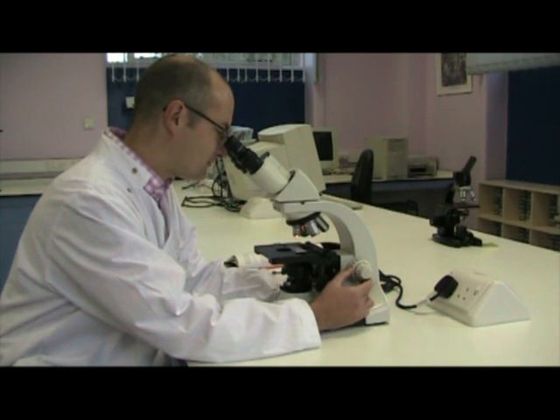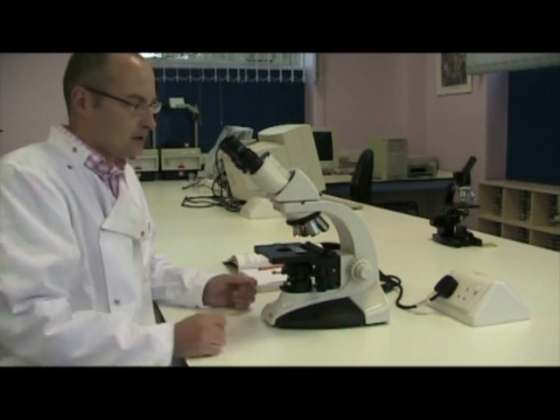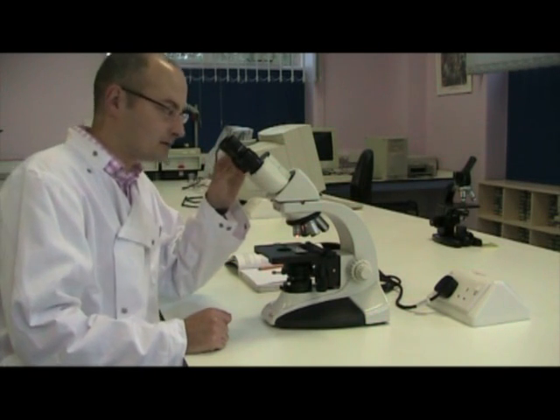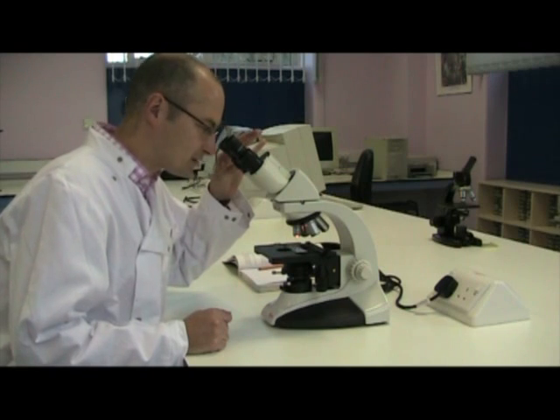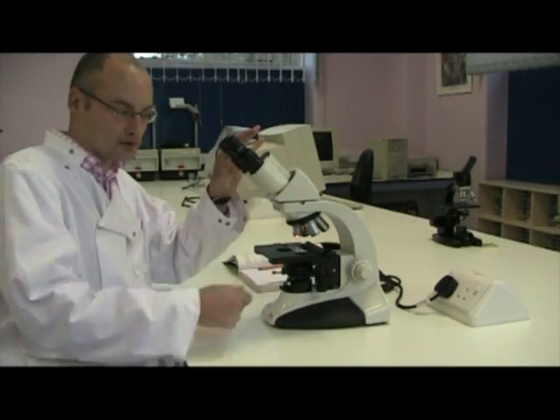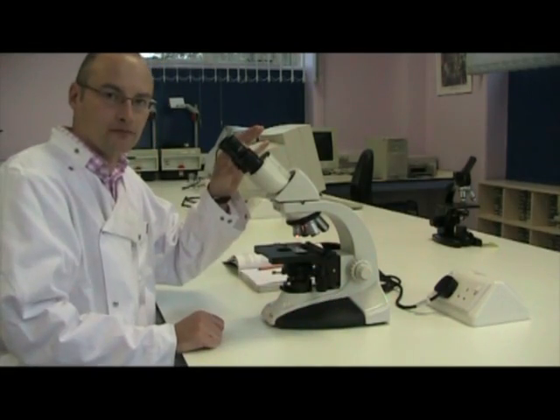When the specimen is in focus, then close your right eye and look down the left hand eyepiece. Focus the specimen, but this time using the focus setting on the eyepiece. Don't touch the microscope focus setting.